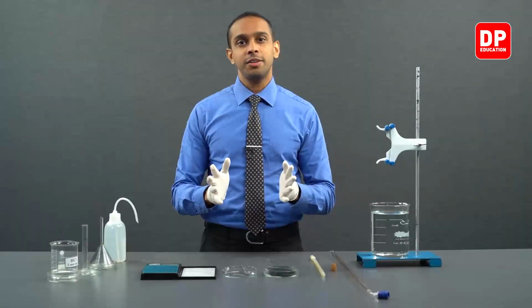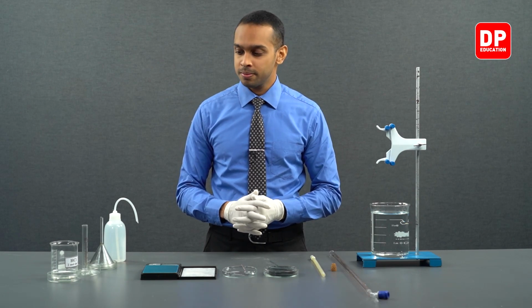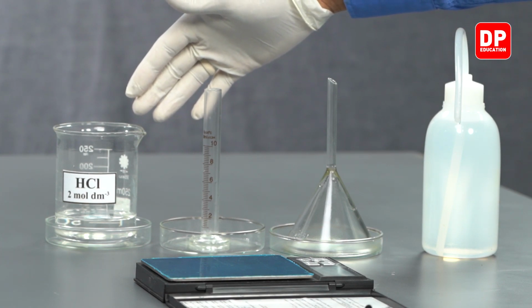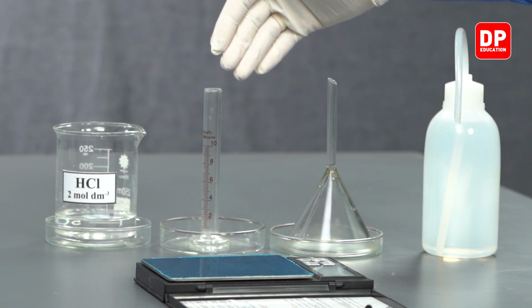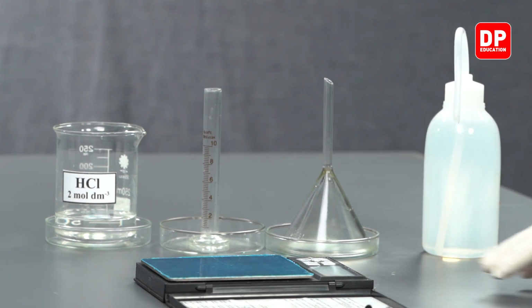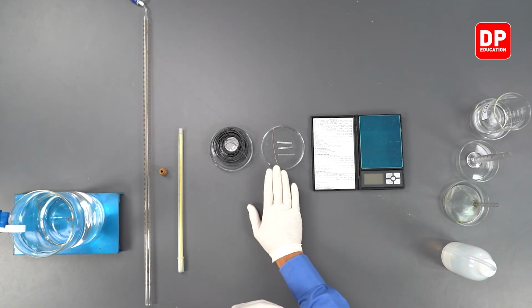Now, without further ado, let's go on to identifying the reagents and the equipment used for this experiment. Let's identify the reagents and the equipment we will be using for this practical. We'll be using 2 moles per decimeter cube HCl. We'll be using a measuring cylinder to measure the HCl that we are going to be using. We'll be using a funnel, a wash bottle, a digital balance, magnesium strips.